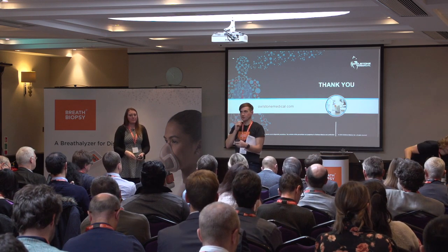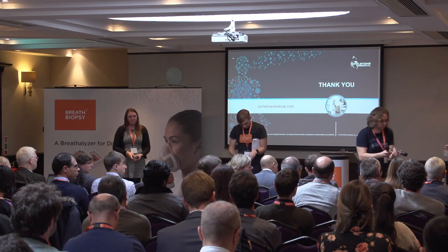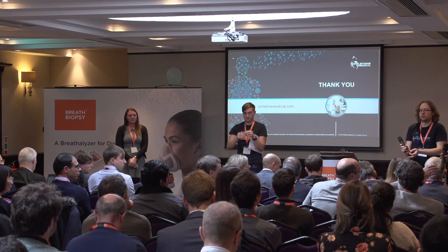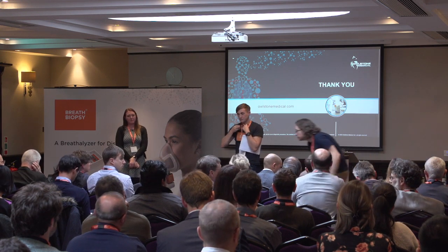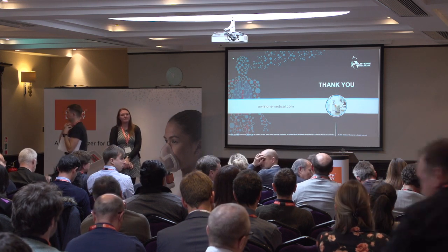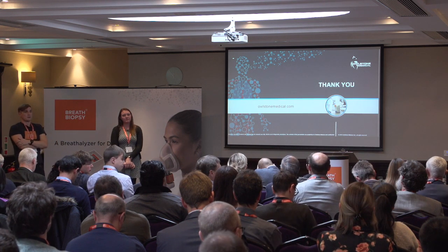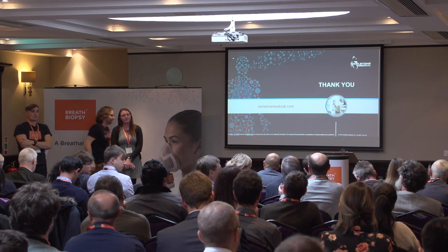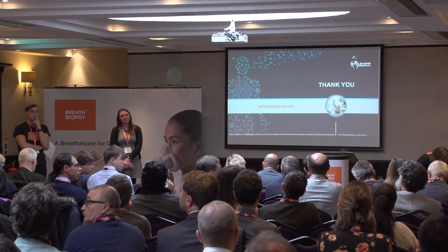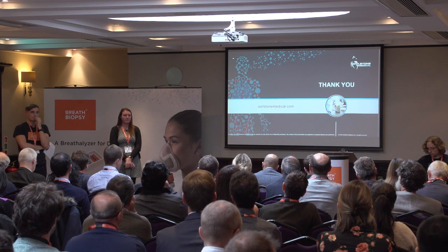So, any questions? Yep. Thank you very much for your presentation. Igor Bezverki from Dijon, France. I have a small question about what comes before mass spectrometry, about GC. Can we play with the column, maybe using 2-column approaches? Do you look for this part also?